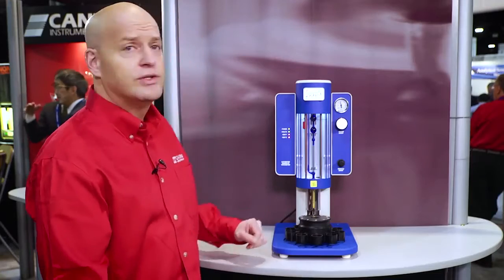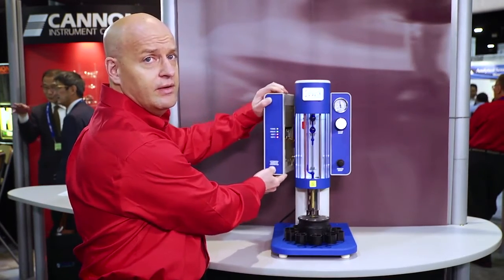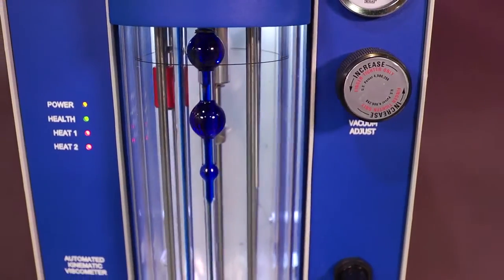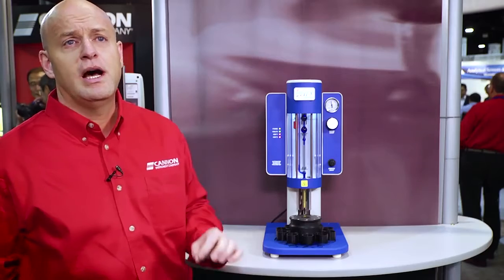This particular system is modular with all of the electronics contained in the left ear and all of the valving on the right. Built-in safety features include a bath float level and over-temperature sensor, and the bath has the capability to operate between 15 and 100 degrees Celsius.